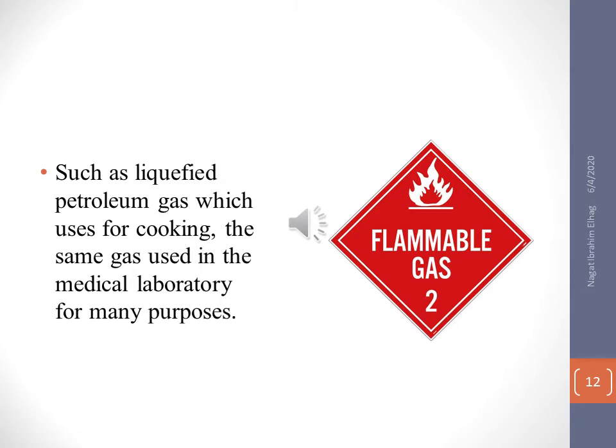So you have to make your lab workers aware when they are handling the flame during the work, to ensure the gas is switched off when you leave your lab, because it can make a dangerous fire, and it can cause injury to your lab and also to your lab workers.